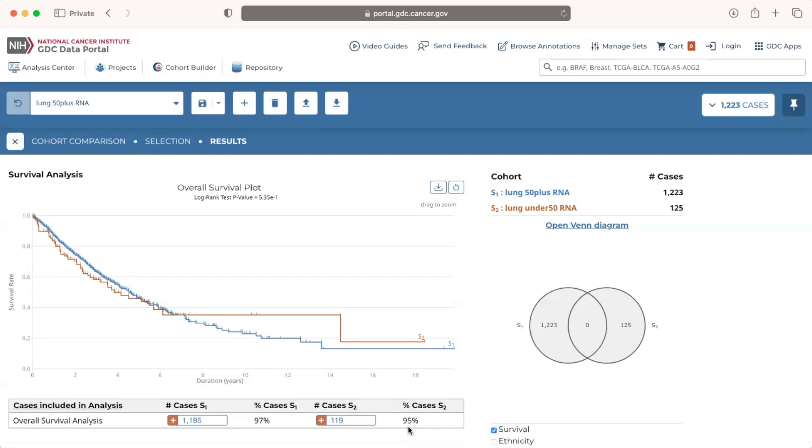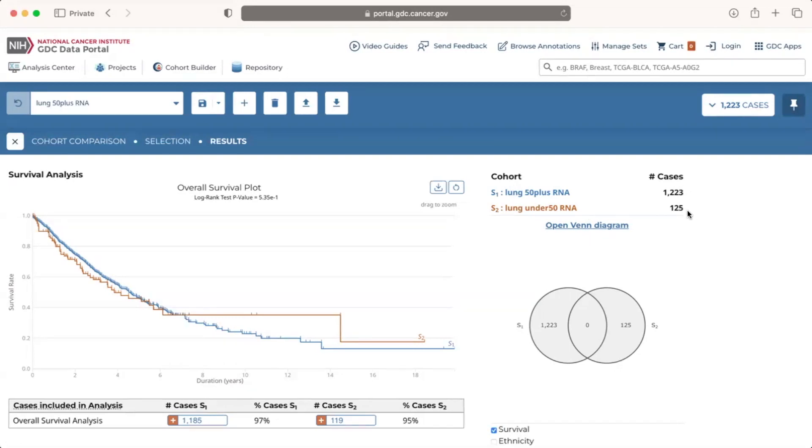To the right of the survival plot is a key displaying the two cohorts, a number of cases in each, along with the color coding used in the visualizations on this page. The individual plots in the cohort comparison tool do not have legends, but this key can always be found in the upper right corner of the page.